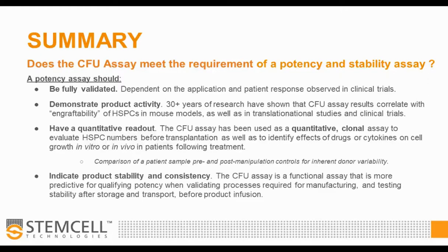So how you're using the CFU assay matters. For example, if you've done genetic manipulation, you can first use it to understand that you have a good product and all your cells are growing. But then you can possibly pick clones and look at the number of clones that actually express the modification, and identify a range that you would have observed from the clinical trials that is important in giving you a successful transplant. So it's always good to set it up at the front, because it could be not only a potency and stability assay, but possibly also important in the identity of the product and possibly the release.